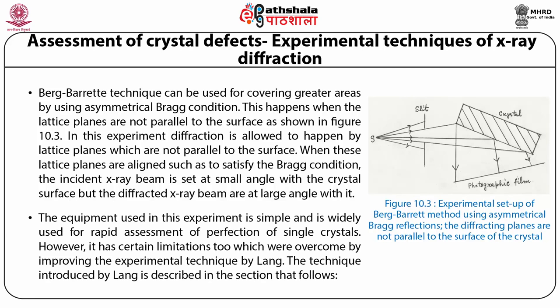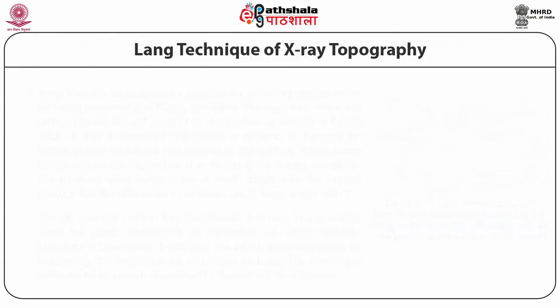The equipment used in this experiment is simple and is widely used for rapid assessment of perfection of single crystals. However, it has certain limitations too, which were overcome by improving the experimental technique by Lang. The technique introduced by Lang is described in the section that follows. Lang technique of X-ray topography.